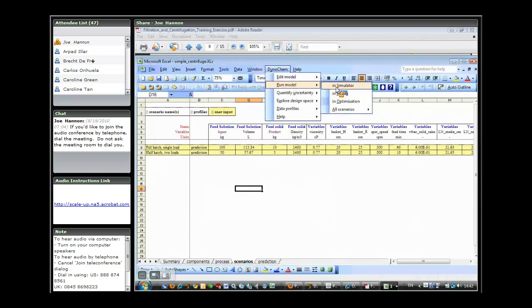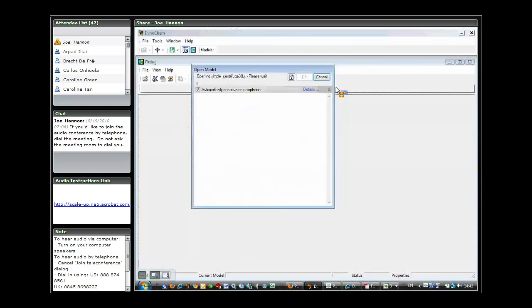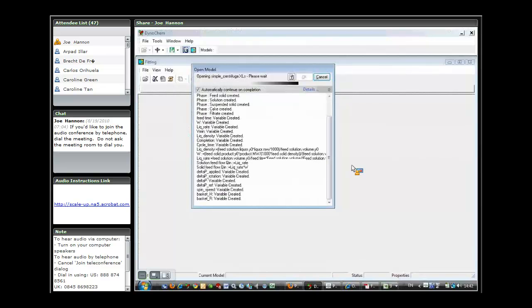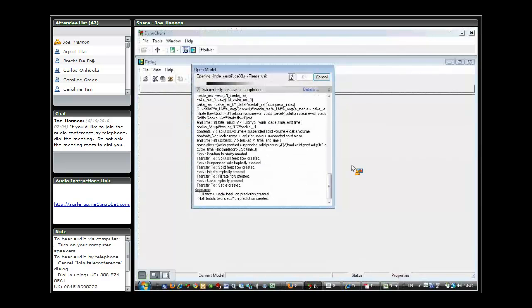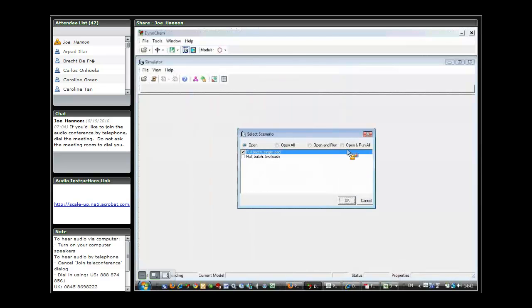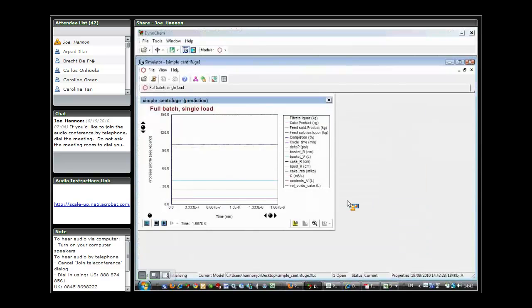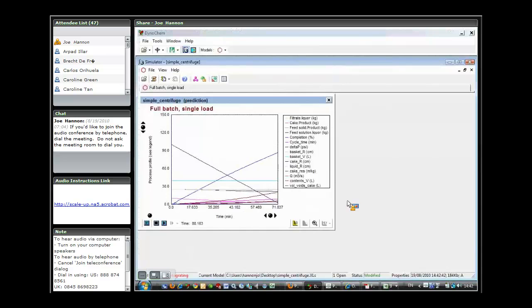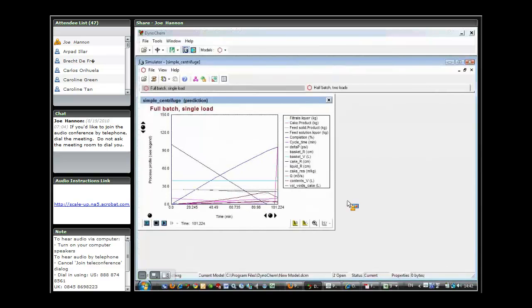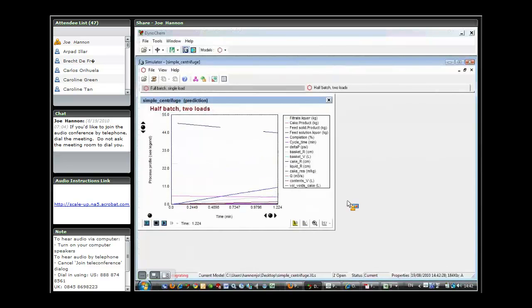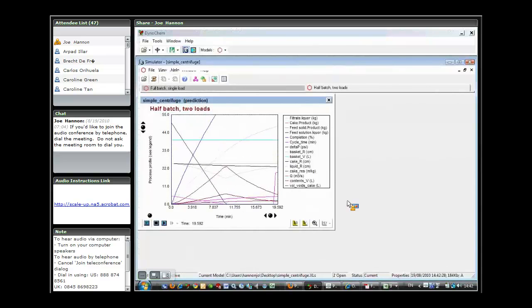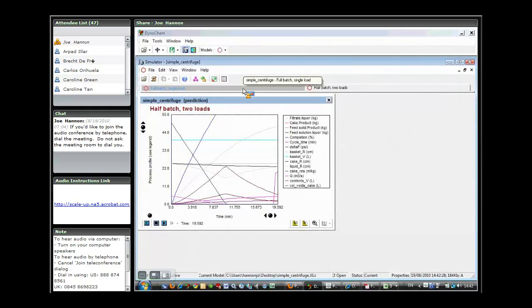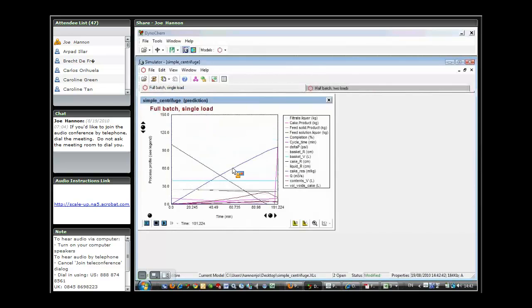Back into where we took a quick look at how the filtration model looks in simulator. I'm just going to open and run both of the scenarios. Then I'm going to use the tab control to go back and look first at the first scenario and then come back and look at the second scenario.